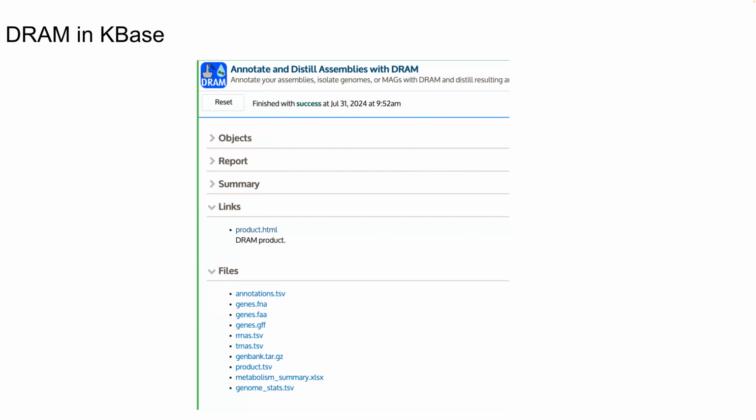Or if you have something like metaproteomes, you can map to the genes.faa. And those files all have the same headers that can then be linked back to the annotations file or any of these other files. The point is that all the files are linked. So if you map to something like the genes, using those headers, you'll be able to easily link into the annotations and see per sample abundance profiles.